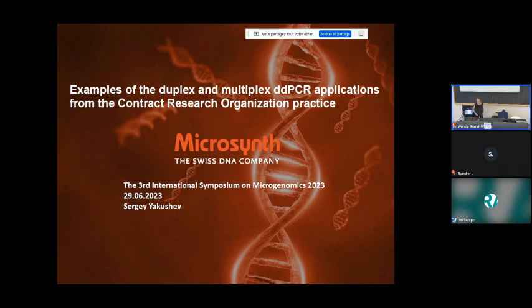And one of the other big areas, of course, is looking at the mammalian cells with the different viral vectors. Can we actually get a measurement using digital PCR and single cell isolation techniques to literally count how many particles are being produced in those producer cells? And then can we tweak it? Can we make it more efficient? Because we want it to be as high as possible, keeping our cells happy, working well. But it's time, money, and resources. So in the biomanufacturing, it's a crucial area of that workflow.